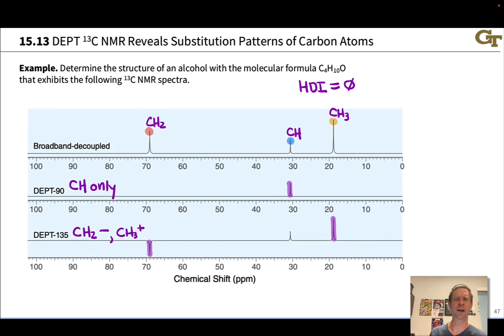This could be done a few different ways, but I would tend to try thinking about chemically equivalent methyl groups because these are relatively easy to position such that the molecule is symmetric. Let's entertain the idea that this compound has two equivalent CH3 groups. Those could both be attached to the CH group. This would make sense in terms of chemical shift with both showing up in the alkyl region. Those two signals are looking a lot like an isopropyl group, and we could use the proton NMR to confirm this using splitting patterns.